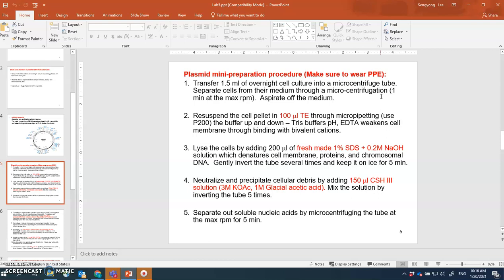Okay, and then once that's done, stop the centrifuge and recover your tubes. Once you have recovered your tube, you need to discard the medium, the clear liquid floating on the top of the tube, using an aspirator. The aspirator is located in the lab. It's basically a vacuum trap device that we made in-house. So you can use that to get rid of the liquid medium without disturbing the pellet at the bottom. Okay, after separating your cells from liquid medium, I'm going to stop right here.